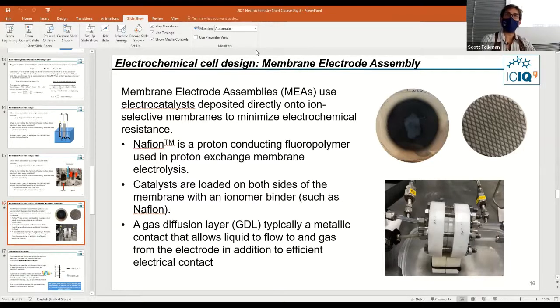Between doing a differential pulse voltammetry and CV, if you get the same information, which one is better? So the audience member asked about differential pulse voltammetry. Let me pull up the slides from last week. So I did not cover differential pulse voltammetry, although it is a technique of mine that I like quite a lot.